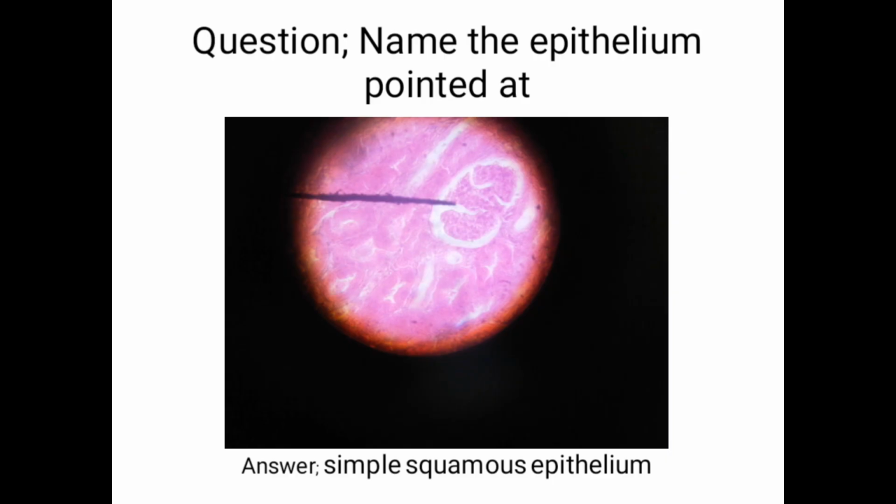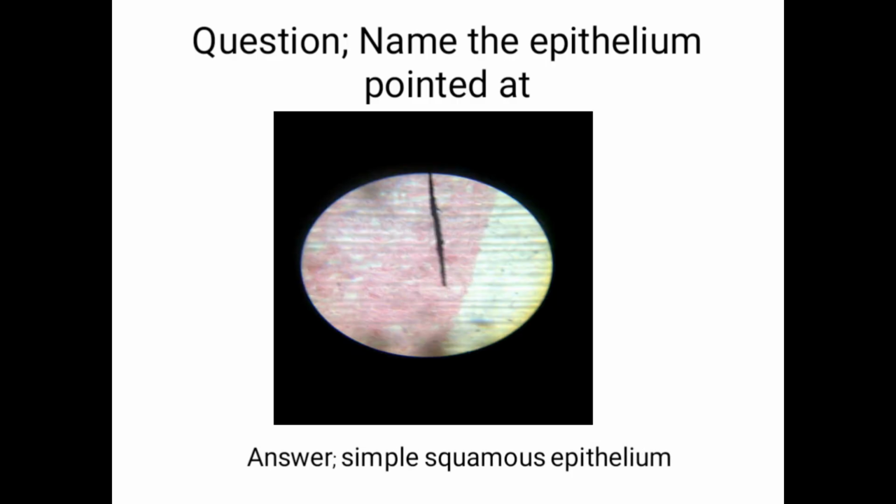Here is another image of simple squamous epithelium. So remember, flattened nucleus, and a single layer of flat cells. Here's another image of simple squamous epithelium.